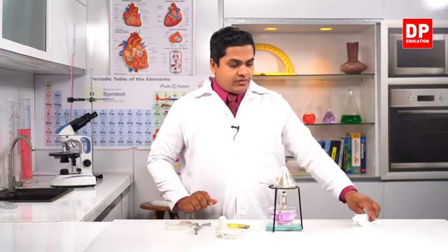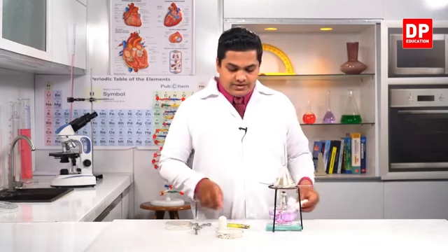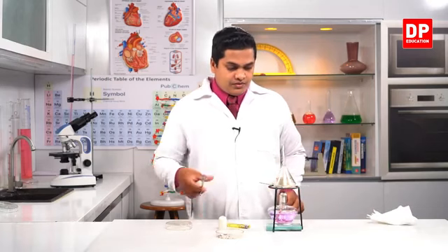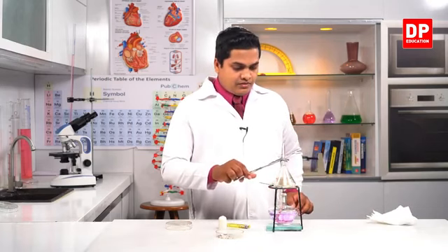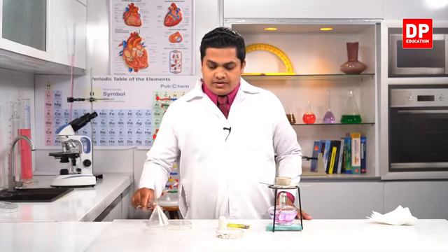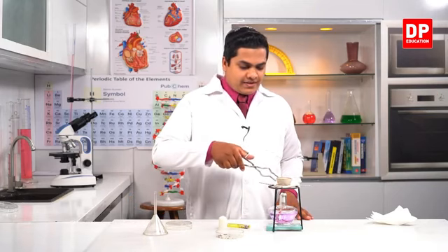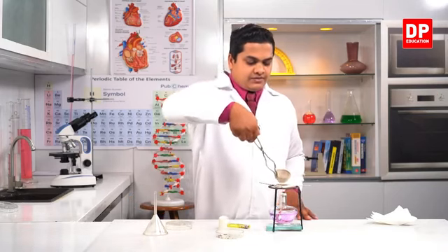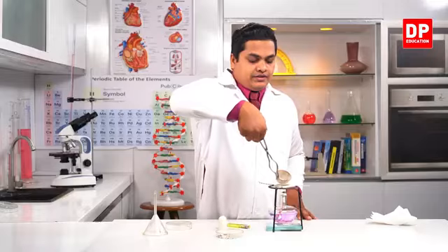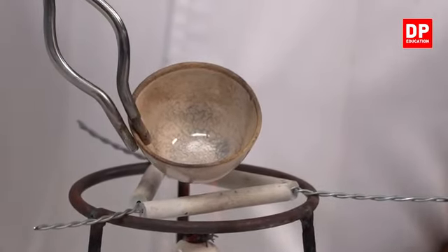So now I'm going to remove this funnel and show you that there is no iodine left in the crucible. See, there is no iodine in the crucible. All of it has been converted into a gas.